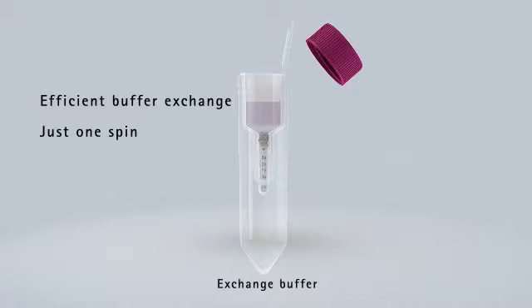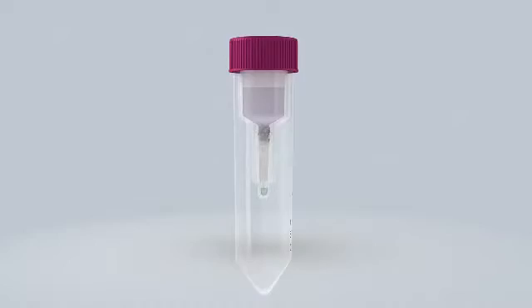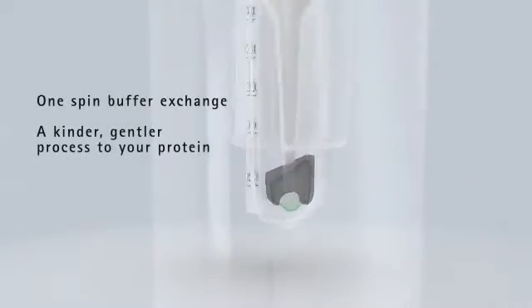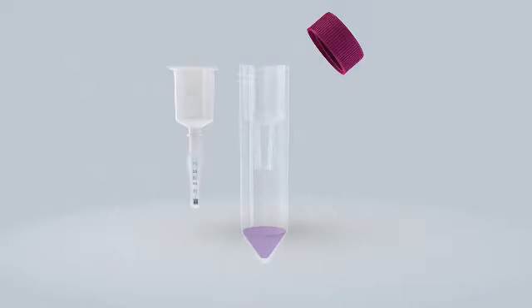The Amicon Pro system is engineered for highly efficient buffer exchange with a single spin. The unique design of the exchange tube is the key to fast, gentle and efficient buffer exchange.